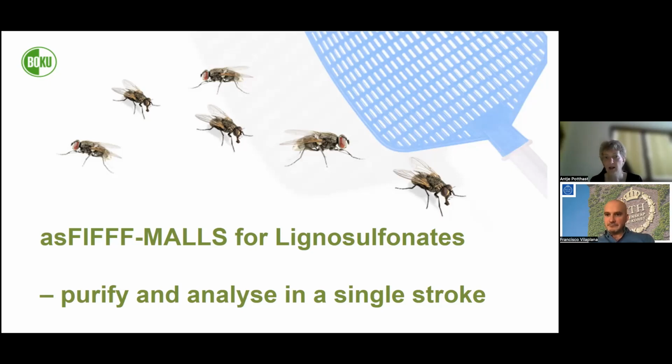Okay, good. So there's always a discussion. The dN/dc is a constant for a polymer, but of course it can be different for the different fractions we have, and it will be different. But there's not a huge change. So the total error is much larger, what we do for putting GPC together and all the little problems we have still in light scattering. So I would say still light scattering error 15 to 20%. You have to be super realistic on that topic. Thank you very much. I think you addressed it very nicely. But it's a very good question actually. This is something which bothers us also for other polymers. All right.